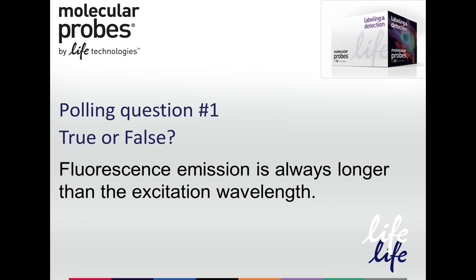I can see that of the respondents, we have about 80 people have responded, and 96% of you have correctly identified the answer as true. The emission wavelength is lower in energy and thus longer than the excitation wavelength.